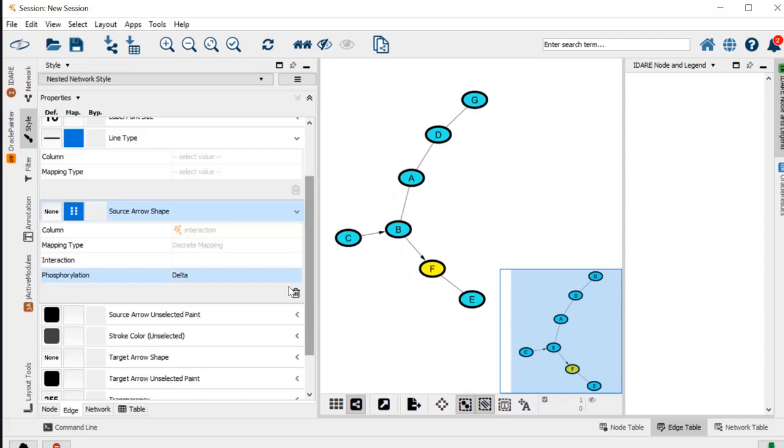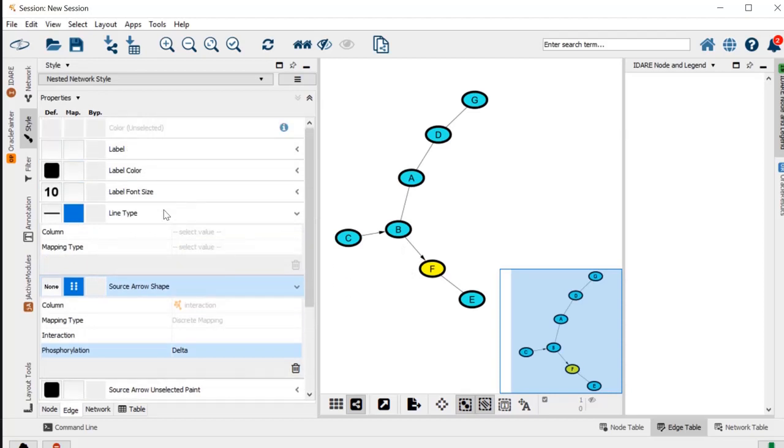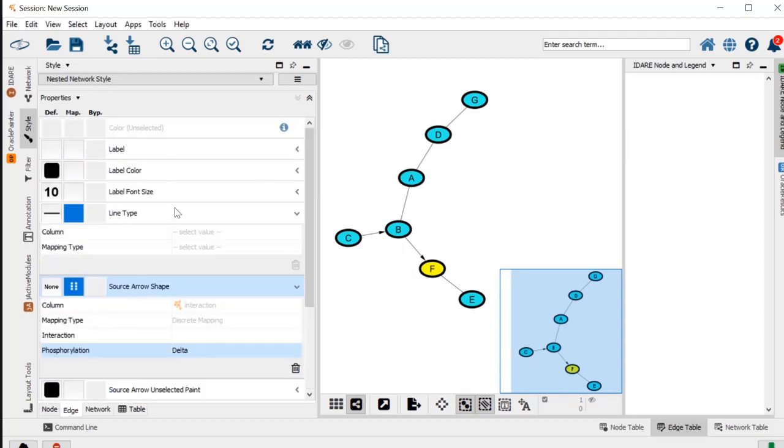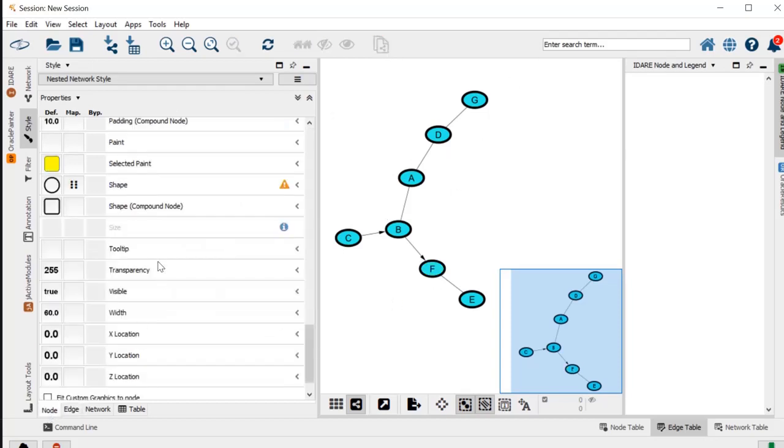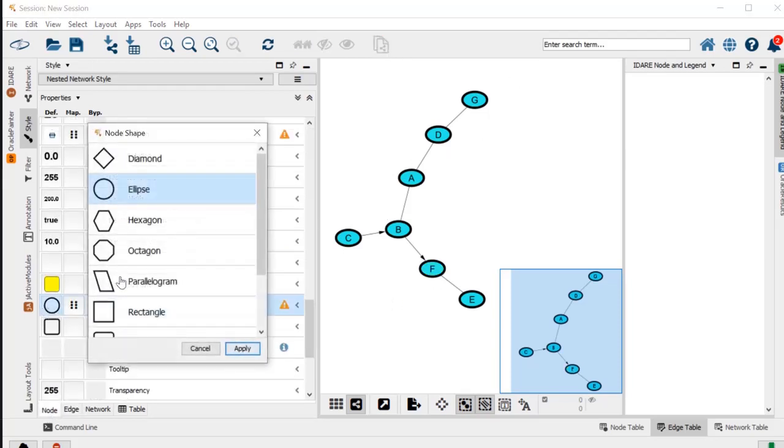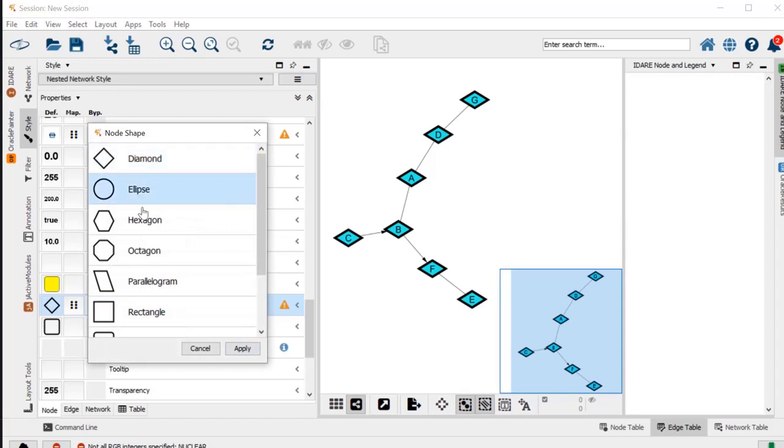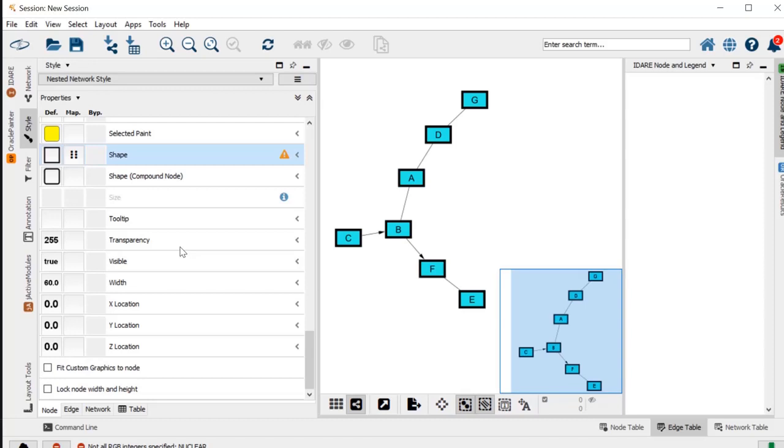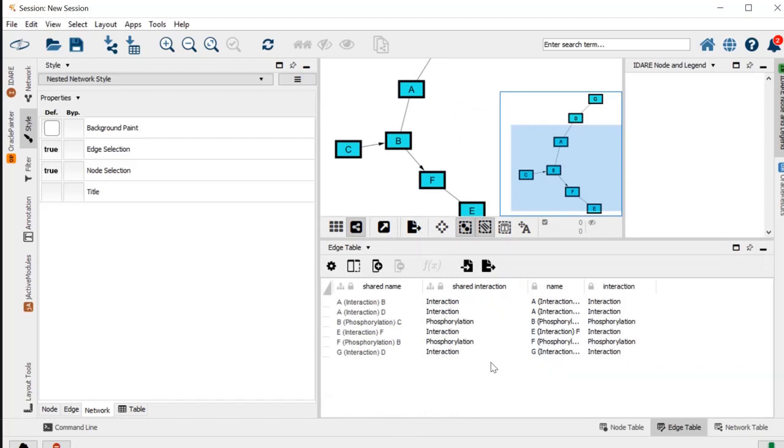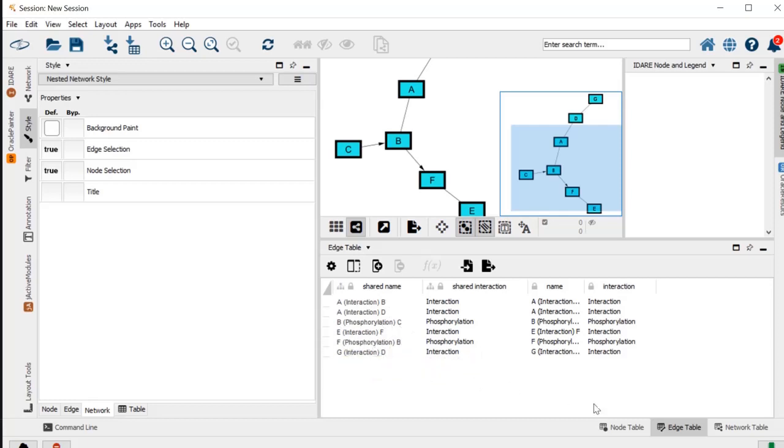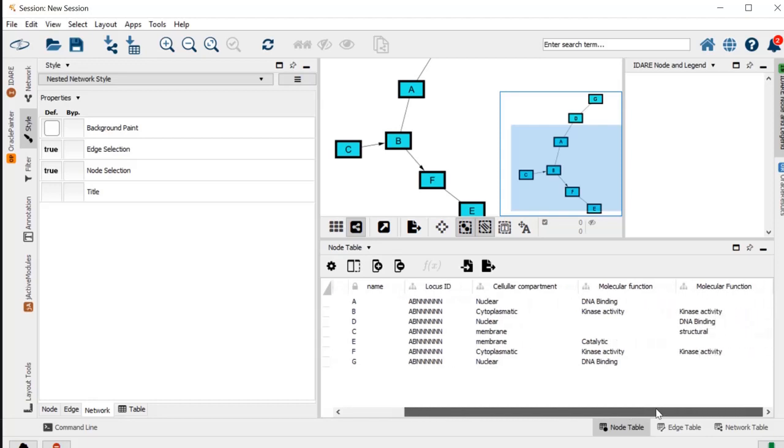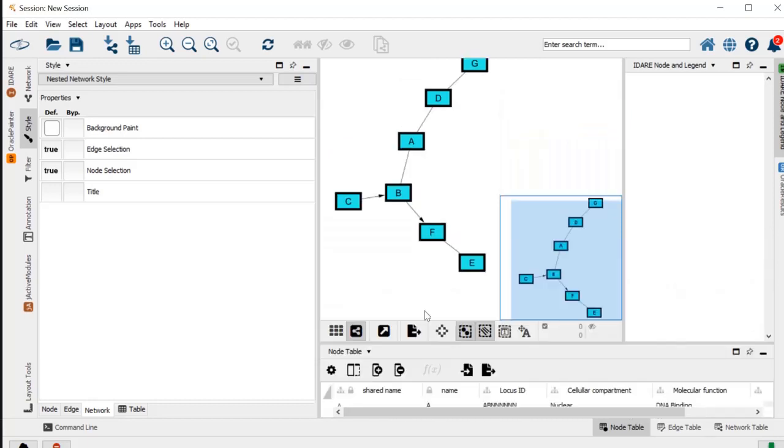You can also change the shape, obviously, from rectangles to diamonds—it's really not that big of a deal to change them as you wish. In here you should also have the edge table, like A interacts with B, B phosphorylates C, and so on. You have here the network table. This is how you can generate a simple protein-protein network.